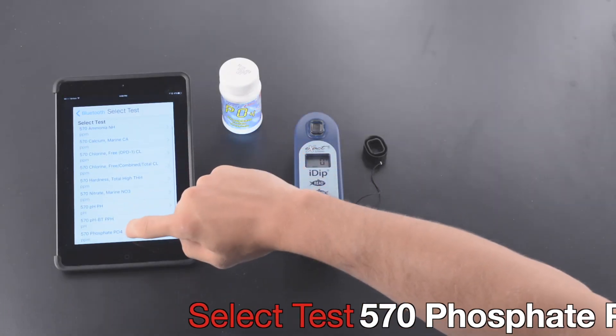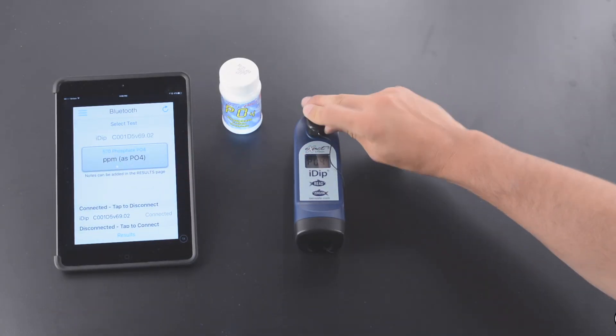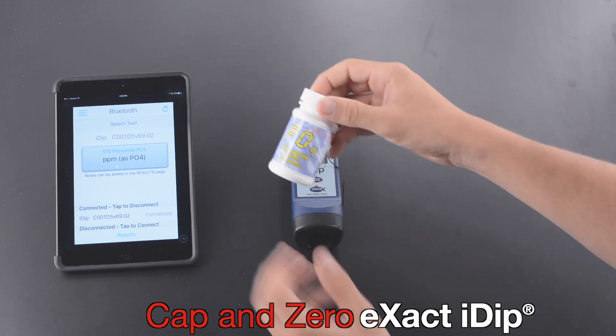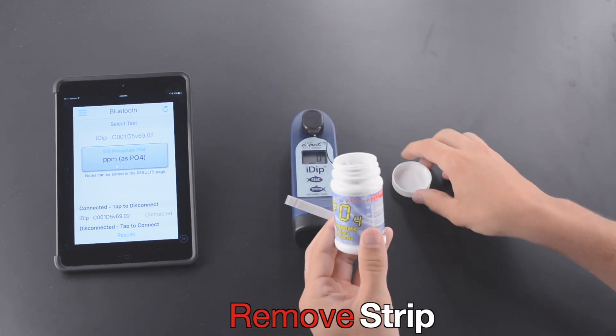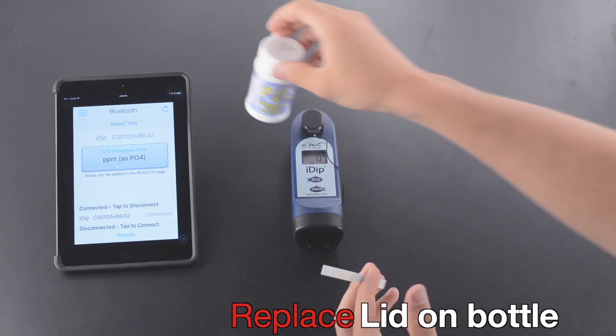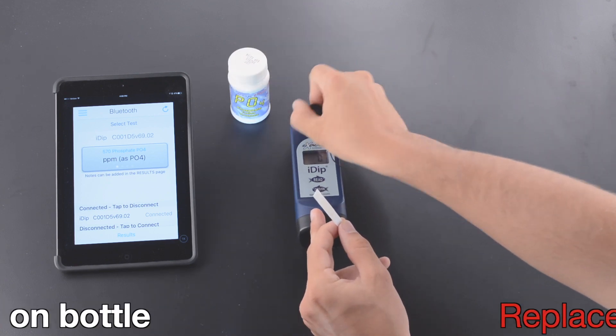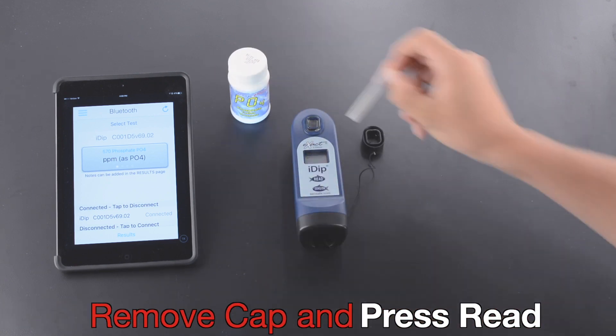Select Test, then cap and zero the eXact iDip. Remove the strip and replace the lid on the bottle. Remove the cap and press Read.